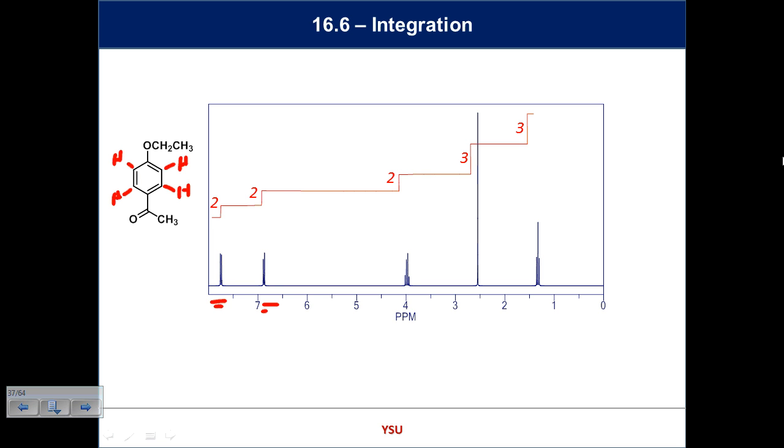There are differences in electron environments, but you've got 4 protons. Why do you only see 2 signals? Symmetry. And when we get to C13 by the end of the week, symmetry is killer. Symmetry is everything. That molecule is symmetrical, and so you only expect to see the protons here, maybe next to the electron withdrawing group, maybe that one, and this one further away, maybe that signal.